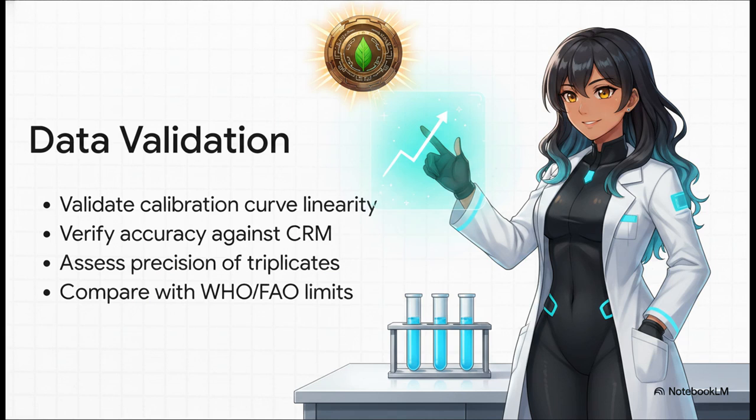But look, a good scientist never just blindly trusts the first number they see, right? We have to prove our findings are rock solid. So we validate our calibration curve linearity, making sure our R-squared value is greater than or equal to 0.9990. We verify our accuracy by checking that our machine correctly measured that known certified reference material. We check our precision by comparing the triplicate results. And ultimately, we take our final heavy metal data, things like lead and cadmium, and compare it directly against the World Health Organization and FAO permissible limits.